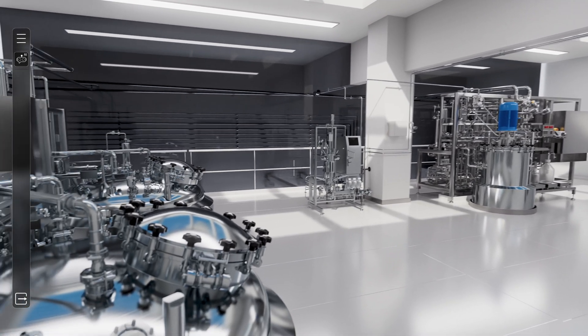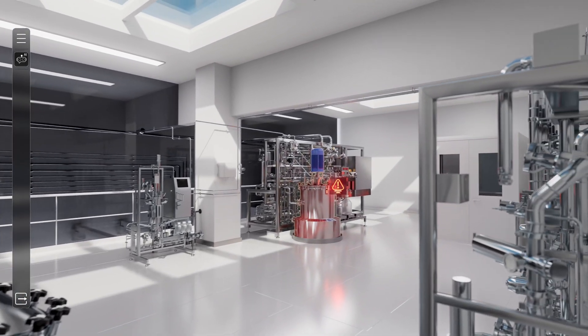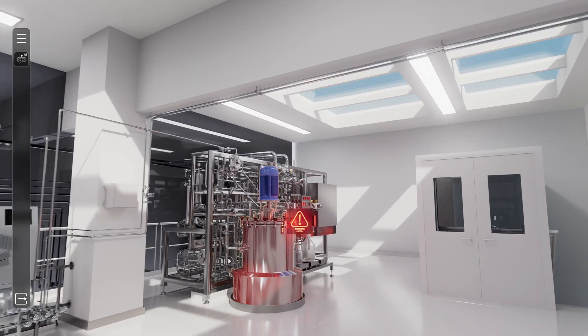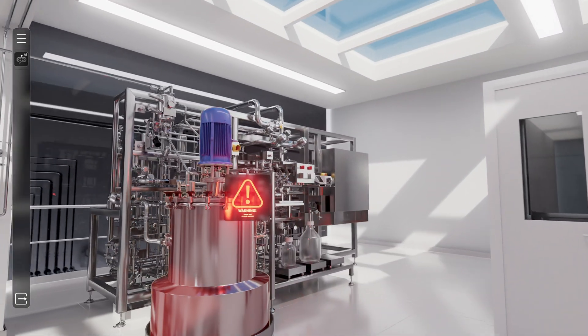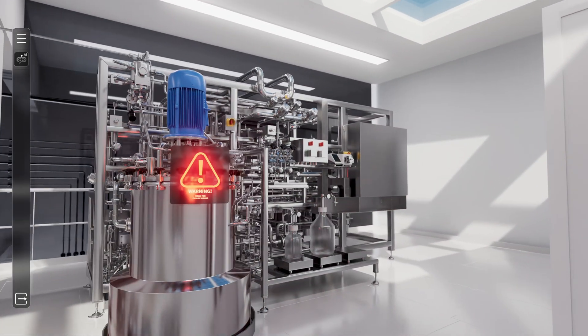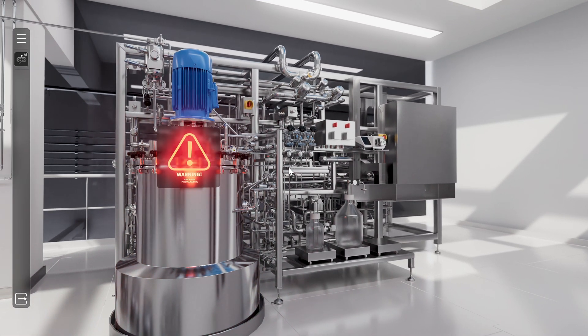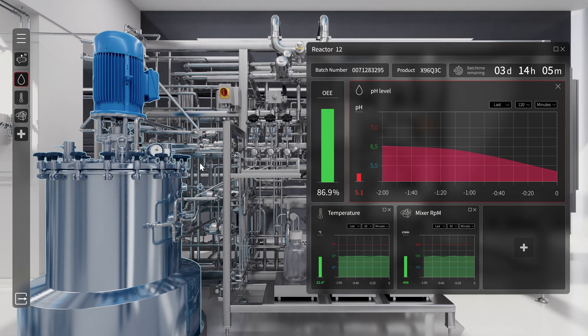Using her keyboard and mouse, she navigates seamlessly to the source of the issue. Linda navigates to the skid and selects the equipment. A dashboard opens, displaying all live data in a single view.